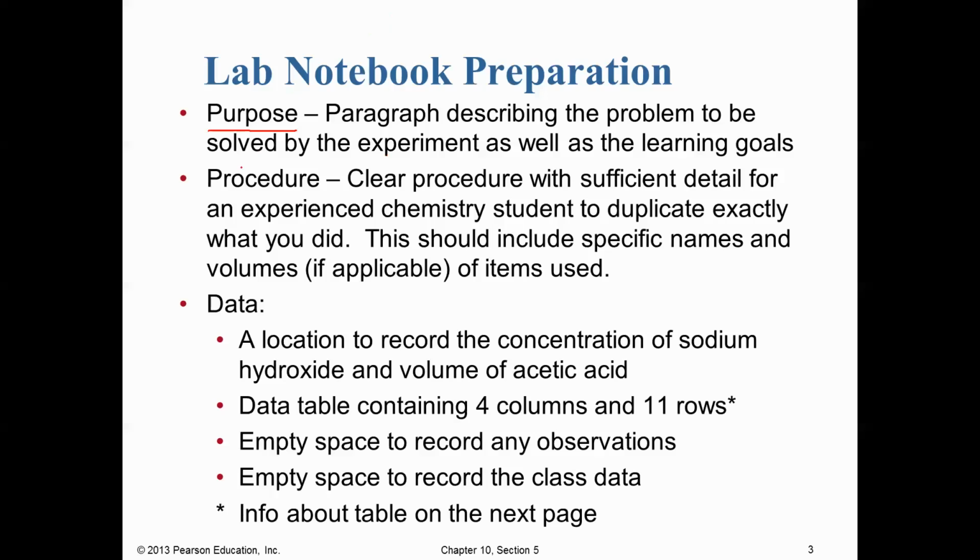In addition to the purpose, you're going to need a procedure. You want to make sure the procedure is clear and relatively detailed, because again, you may need it down the road for that lab exam. And also, this is practice for when you might be writing scientific papers or such. You want to make sure it's sufficient detail for an experienced chemistry student, someone who knows at least as much as you, to duplicate exactly what you did in the experiment.